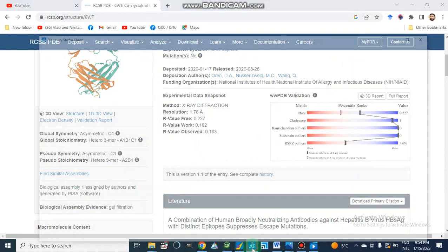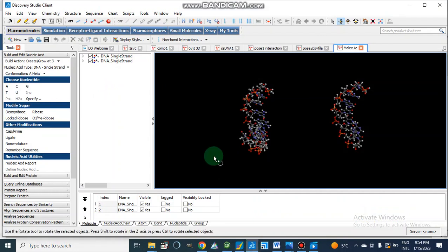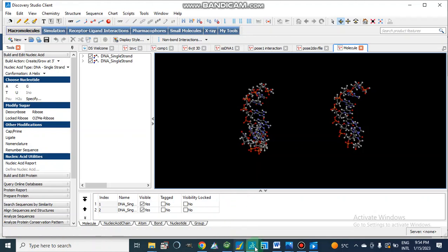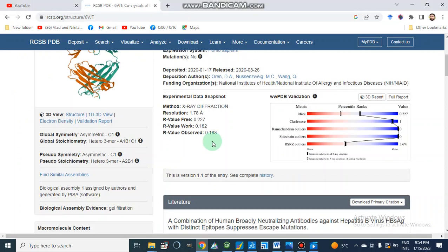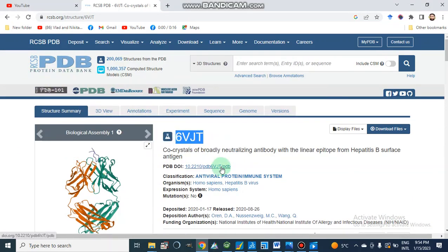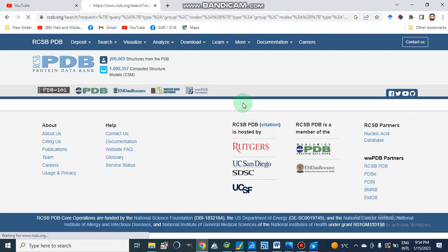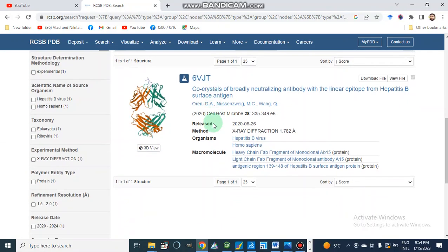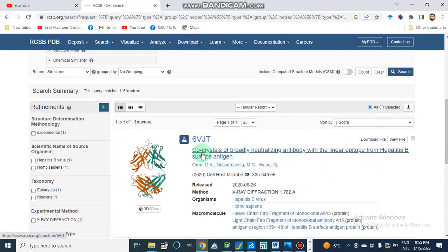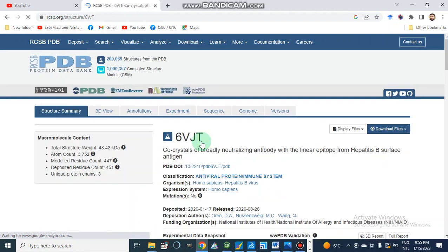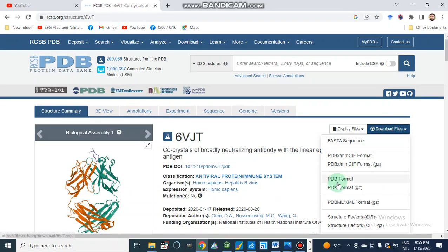Now we will move to macromolecules. First we will study how we can retrieve macromolecules from different databases. In the case of proteins, as we already discussed in previous videos, we can retrieve them from PDB — the Protein Data Bank. For example, if we need 6VJT, we enter that ID and it will open. This is an antibody of hepatitis B surface antigen, and we get this macromolecule by downloading the file in PDB format.